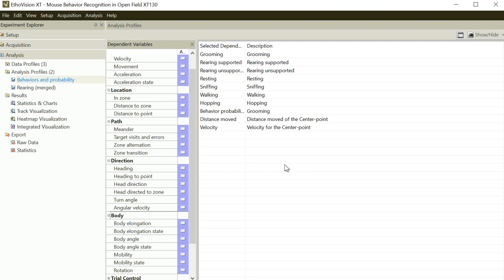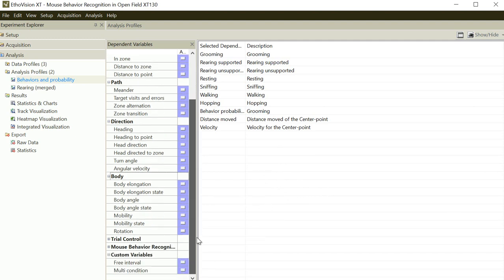So this is based on the theory that rodents tend to spread their body if they have less stress, quite relaxed, their body will be spread widely. And if they are stressed or feeling cold or something, the body is quite curled up. So this is a kind of thing.